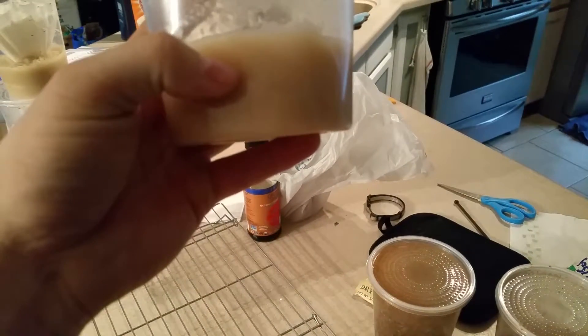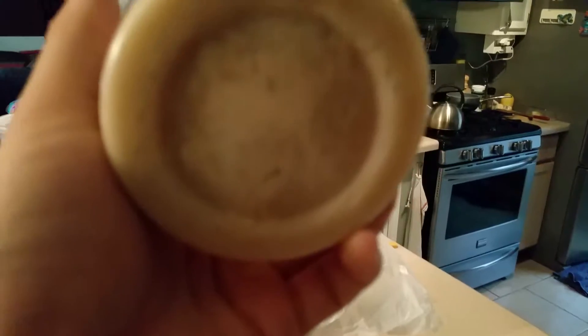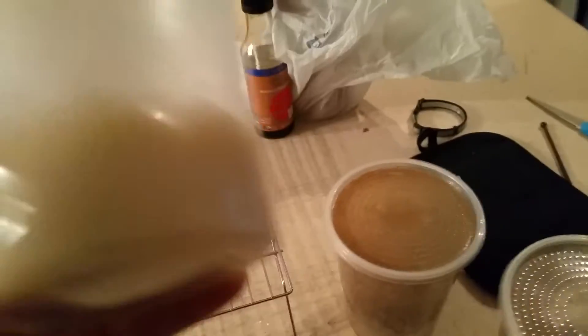So how I do my culture is I put three-quarter cup of media — media is usually down to here — and I fill it up with water to where it's pretty much dissolved and there's no powder left. I might have to change it up now that I switched to Georgia, but I'm about to find out.